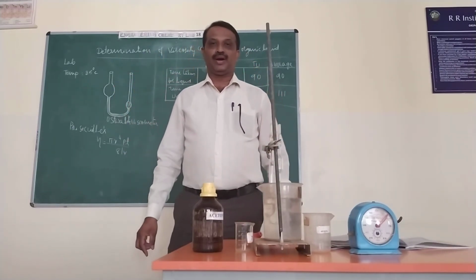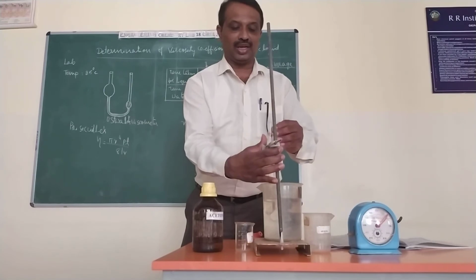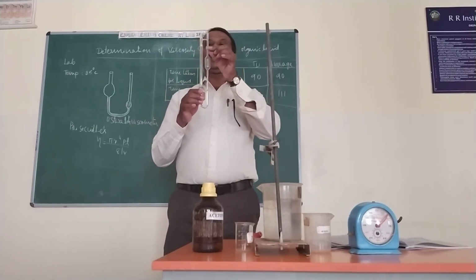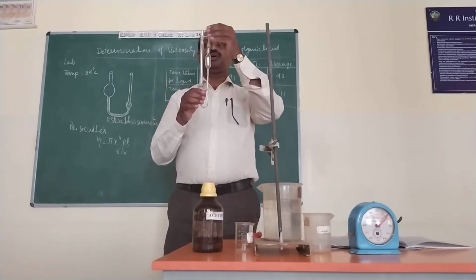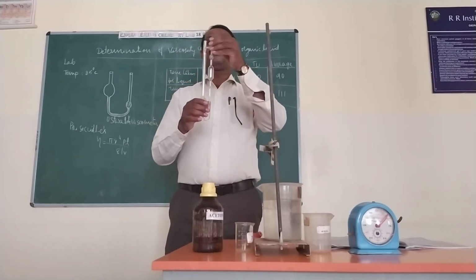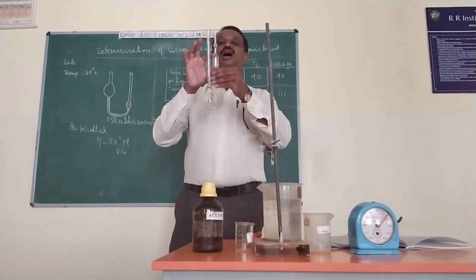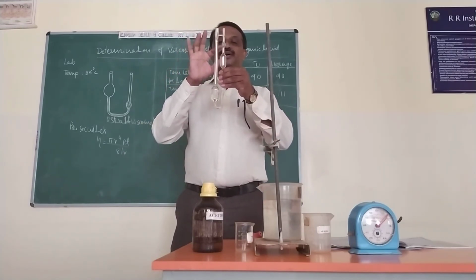So for this, you can find one instrument. It is a glass instrument that we use in our engineering chemistry lab. It is a U-shaped glass tube. In between, there are small bulged portions. Of this tube shape, one leg is a little bigger and one side is small. Only then can we calculate an amount. This is where the bulge portions are. How many ml of liquid we use moves from the upper end to the lower end.